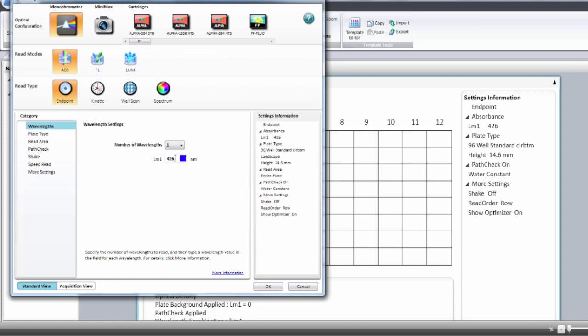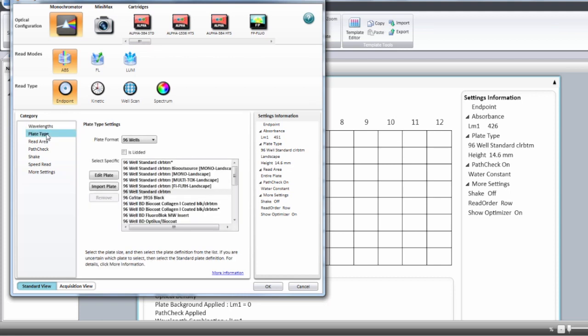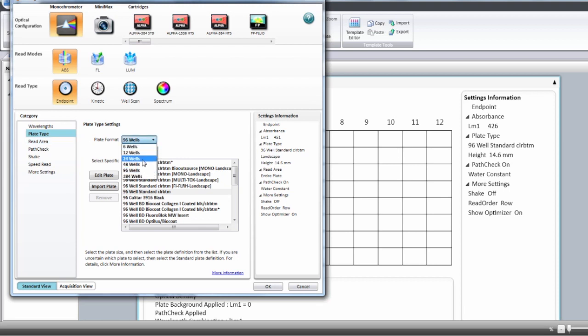For the monochromator based instruments you're going to be able to type the wavelengths of your choice. Then you have the plate type and it's going to be from 6 to 384 well format depending on the instruments.